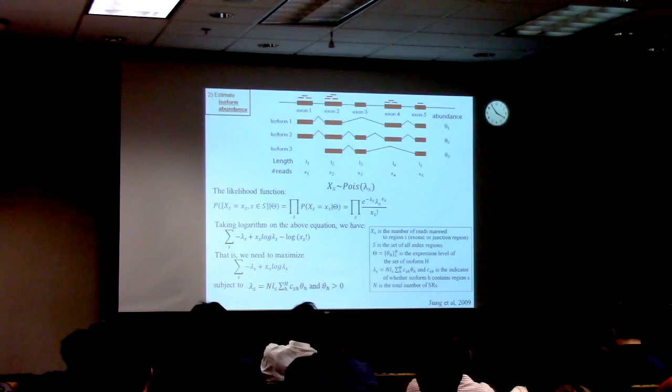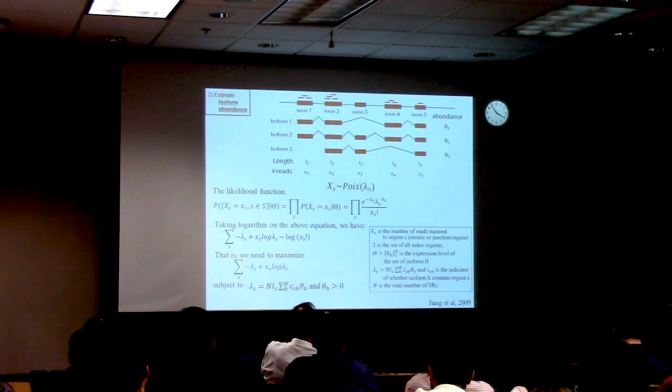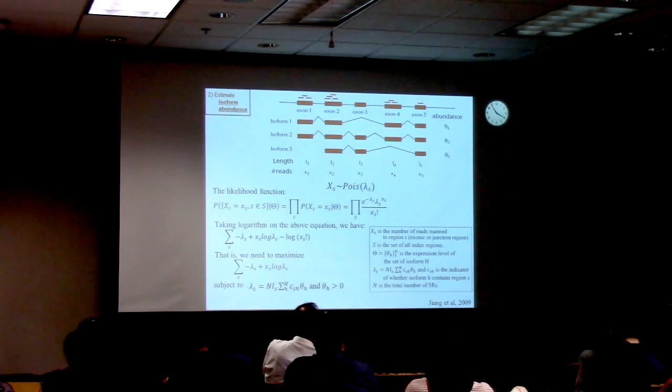I have a question here. You only have a limited number of long reads, right? So how do you know that they sample the space of isoforms? Well, that's a very good question. Actually in the alignment QC, we have some analysis to see whether you reach about 90% or 100% of the sensitivity. And actually the cost of long reads is not very expensive now, so you can generate a lot of data. You can also use a valid protocol called size selection. You can spend more sequencing power on the very long ones so that you can save your budget. Now in our data, if you spend about $2,000, you can cover higher than 90% of the sensitivity. So I think it's okay now. It's not very low throughput now.